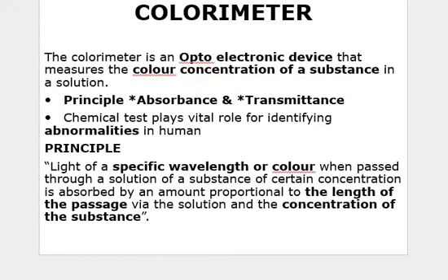As I said earlier, this colorimeter operates based on the color, and when we are discussing color, the characteristics of the color are absorption and transmittance.